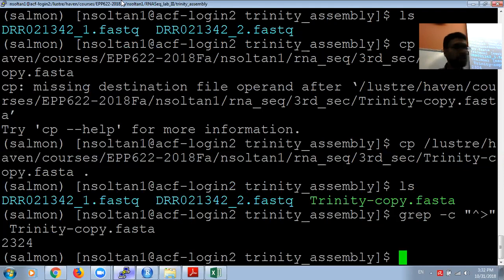And for Trinity, if you want to run the software, you may have to define multiple software at the same time, which is fine. But be careful that when your analysis is done, deactivate all of them one by one: source deactivate salmon, source deactivate NumPy, source deactivate Trinity.